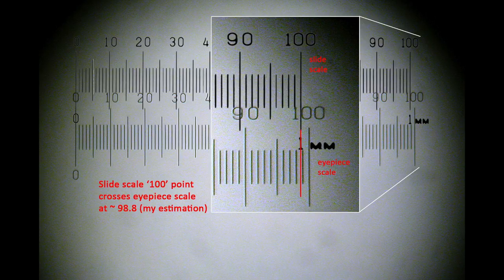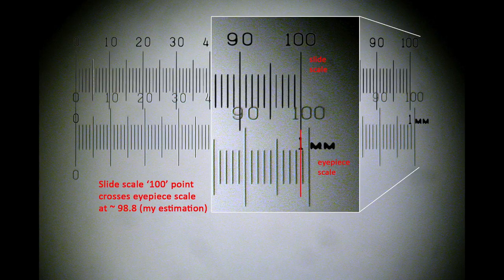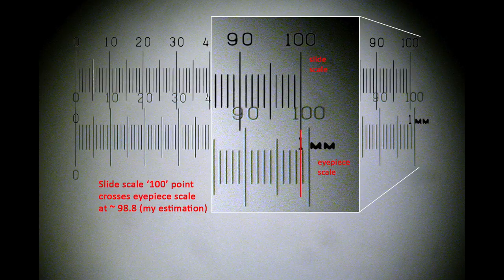But as you can see from the position of the overlapping scales, it is not an accurate 1mm. In this case it's 98.8% of the millimeter. Sometimes in scientific research this may not be good enough.